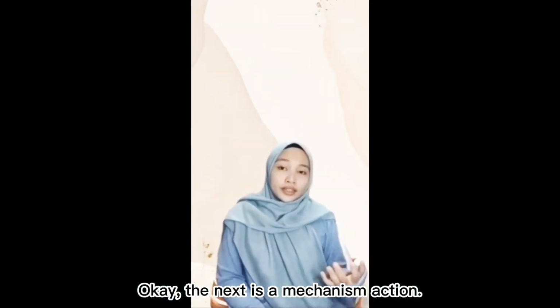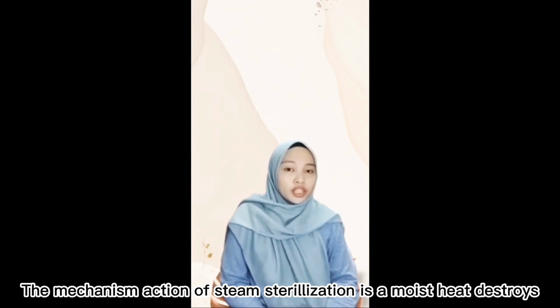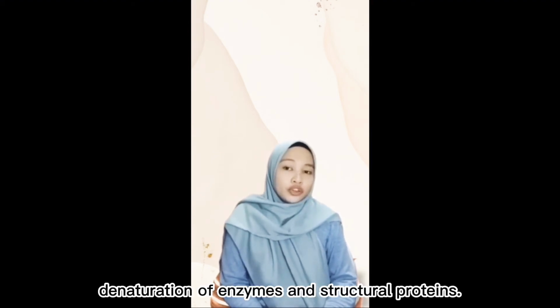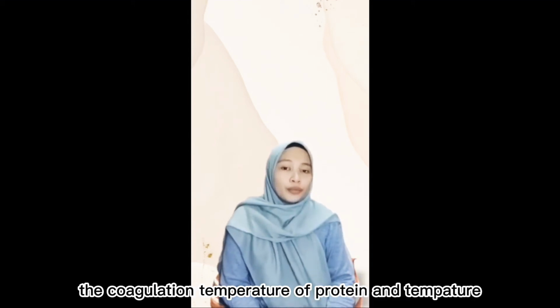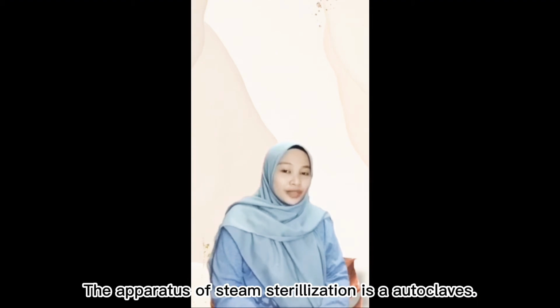Okay, the next is the mechanism of action. The mechanism of action of steam sterilization is that moist heat destroys microorganisms by the irreversible coagulation and denaturation of enzymes and structural proteins. It has been found that the presence of moisture significantly affects the coagulation temperature of protein and the temperature at which microorganisms are destroyed. The apparatus of steam sterilization is an autoclave.